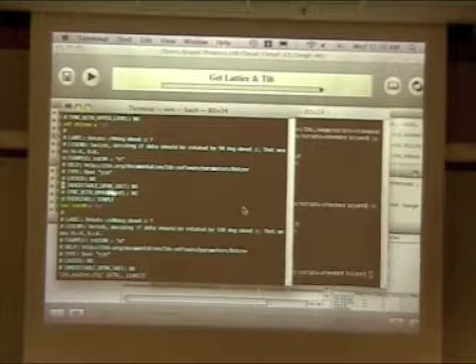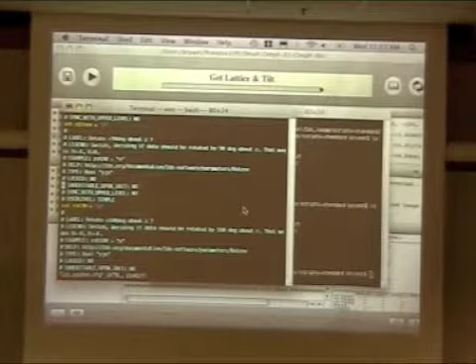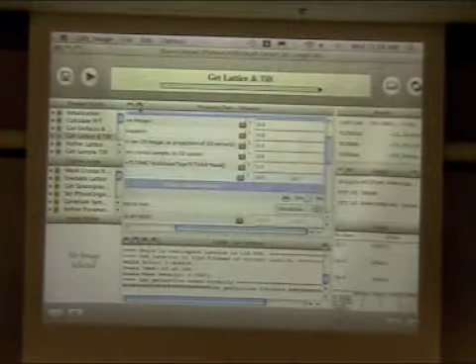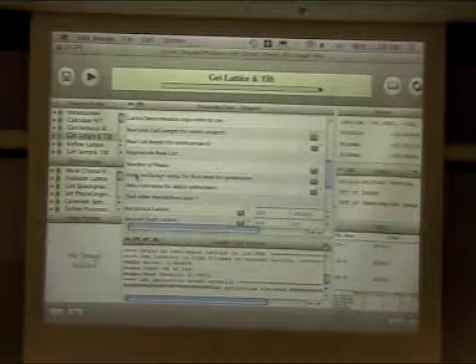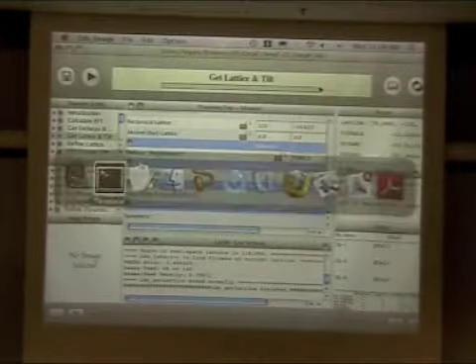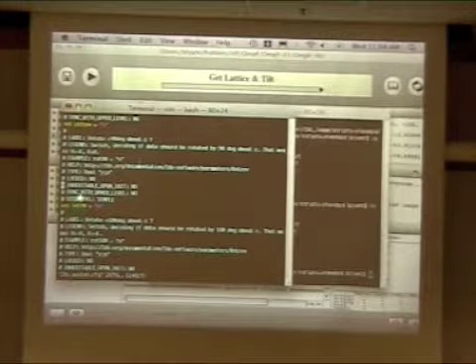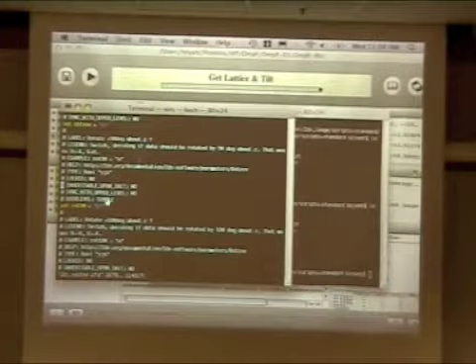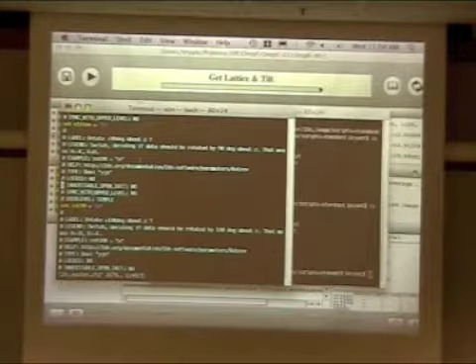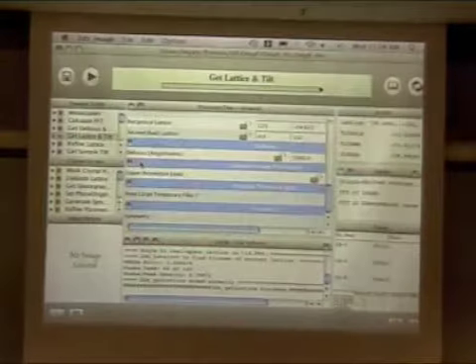And then we've got this little way of hiding data. If there are some values that are just distracting to most people and you really don't ever change them, you can label them as advanced. And we've got this little advanced/simple view. There are a few, you can see them listed here in italics, that are described. Again, it's up to you as to whether that's important or not. And then finally, we've got the unique identifier for what the variable is called in the scripts themselves, and then what it's equal to. Again, C shell. If you were to just run this thing, it would define all of these variables, and you'd be done with it. So, going back to here.